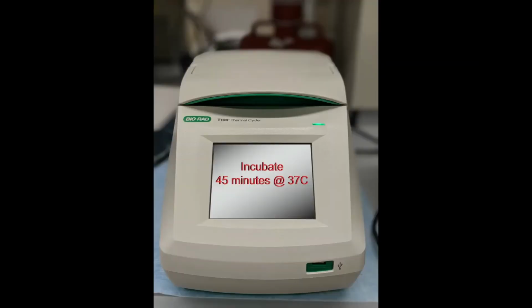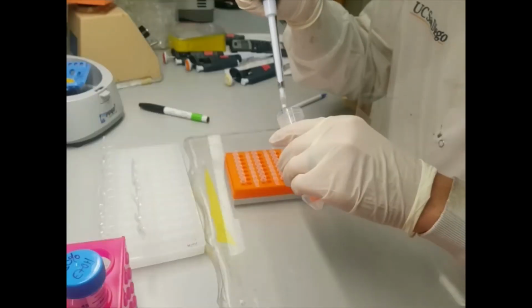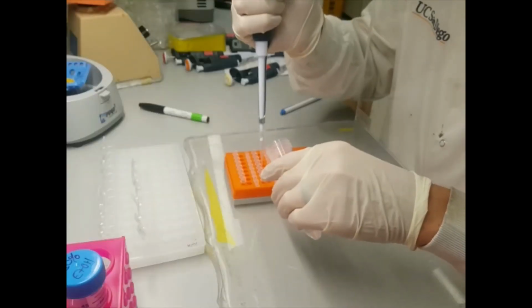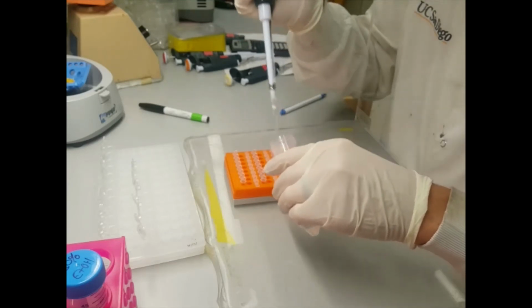This gives you another nice long break, in which, however, you can already label 1.5 ml Eppendorf tubes in preparation for the TRIzol extraction. This extraction is important as bead purification also carries over protein into the next reaction, and we do not want to have any of the 5' enrichment proteins in our library prep.